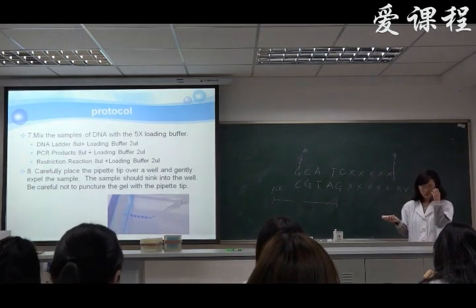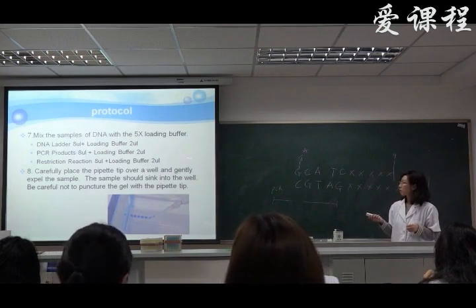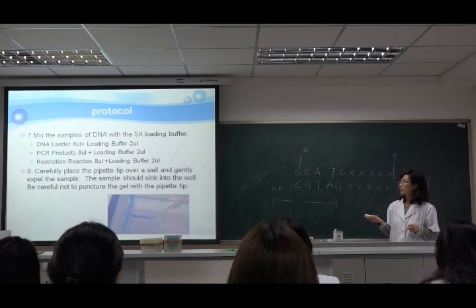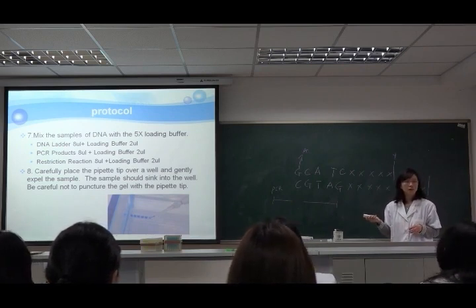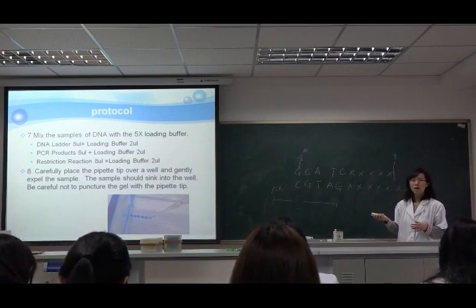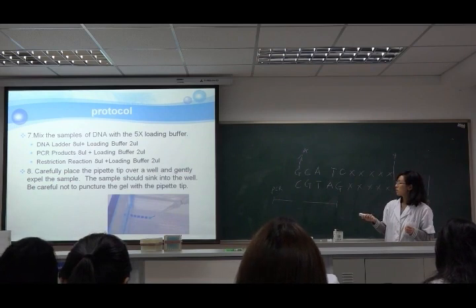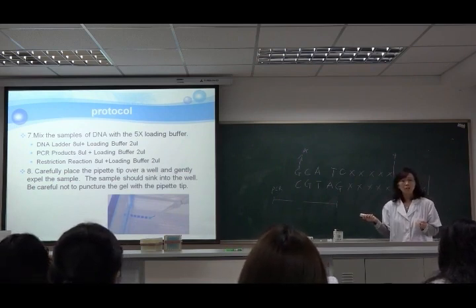Then we will mix the samples of the DNA with the 5x loading buffer. First the DNA ladder. I just told you, the DNA ladder is a DNA marker. It will tell us the bp of the DNA. And add the loading buffer to it. And another sample, we have the PCR products.